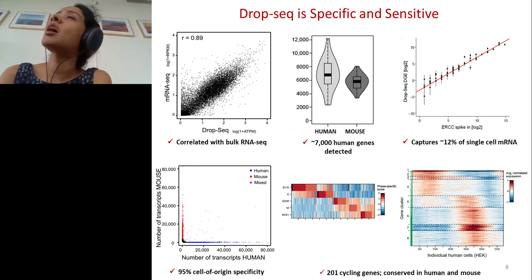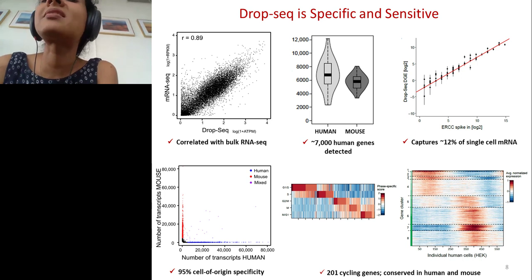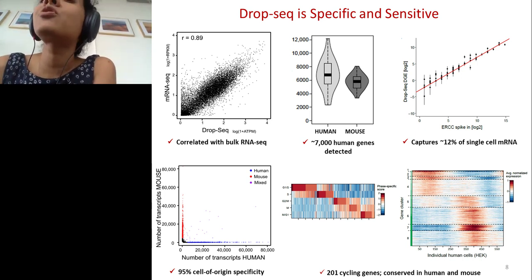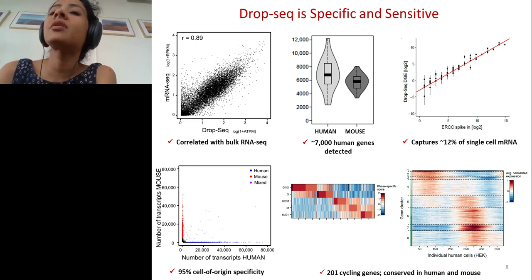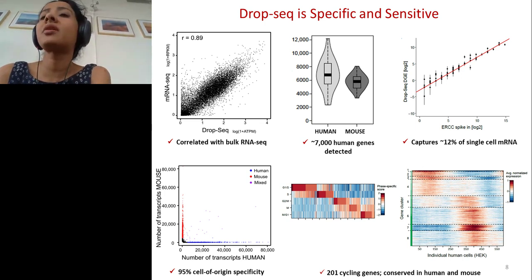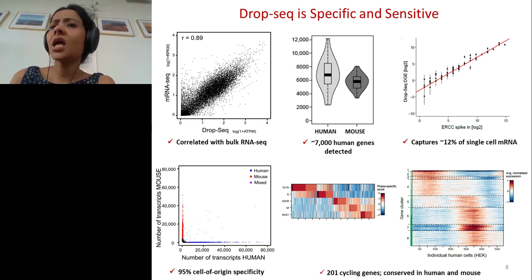The number of such doublets would be double that. So if, let's say, this kind of scatter is about 2% of the total number of cells, our number of doublets, or droplets that have two cells, would be 4%, for example.